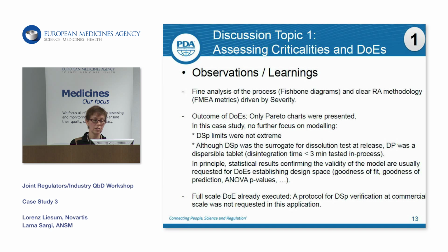previously. Regarding the outcome of the design of experiments, and in particular the statistical evaluation, we were content in this case study with Pareto charts only. We did not further focus on the modeling because the design space limits were not extreme. And although the design space was the surrogate for dissolution testing at release, we took into consideration that the drug product was a dispersible tablet, so dissolution was considered as less critical.